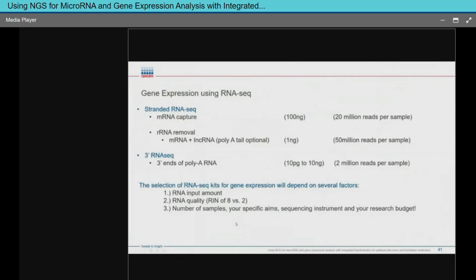So identifying the gene expression component allows us to not only find microRNA. If you're working in serum, plasma, biofluids, a lot of the time the gene expression component is not there. The microRNA is the end story, and your challenge often is in taking that NGS assay and whittling it down to the bare minimum number of markers that you can put onto a digital PCR platform. However, if we're starting with cells and we want to look at the molecular mechanism of what microRNA is doing, that gene expression component can be critical for us in determining these functional consequences.